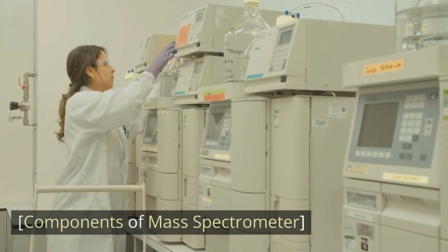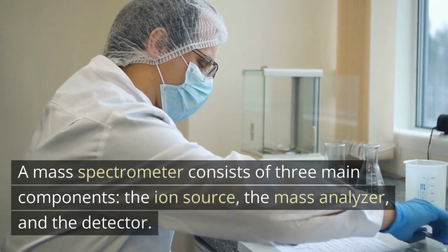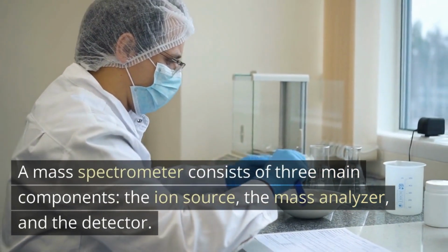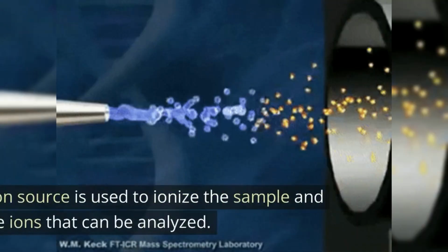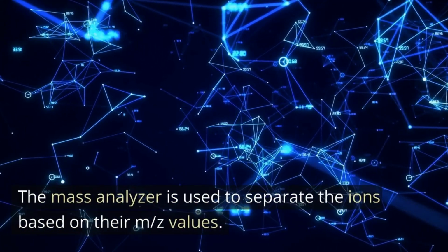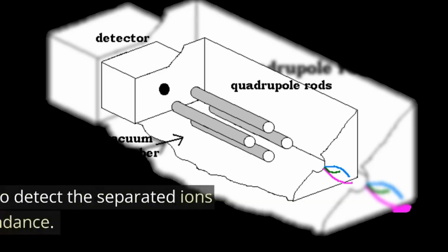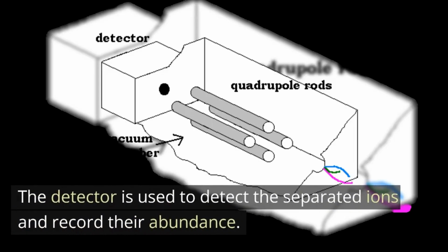Components of mass spectrometer. A mass spectrometer consists of three main components: the ion source, the mass analyzer, and the detector. The ion source is used to ionize the sample and create ions that can be analyzed. The mass analyzer is used to separate the ions based on their m/z values. The detector is used to detect the separated ions and record their abundance.